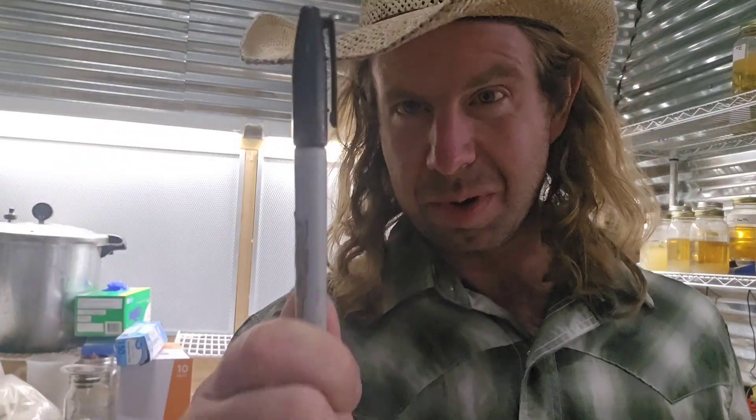Number nineteen: a basic Sharpie. You're going to use this to label petri dishes, label slants, label your mushroom bags — you're always labeling something. Some people also like to use wet/dry paint markers, but I myself always use a Sharpie. Number nineteen.